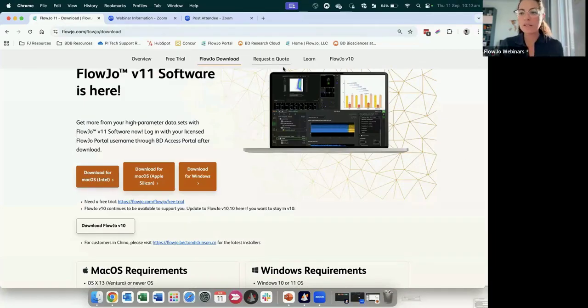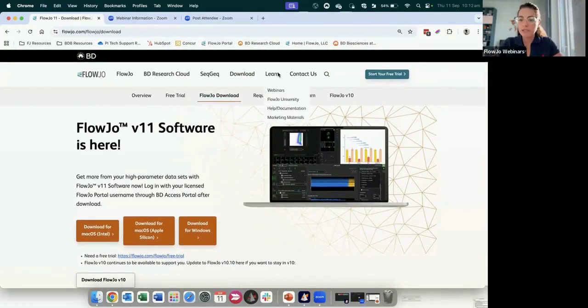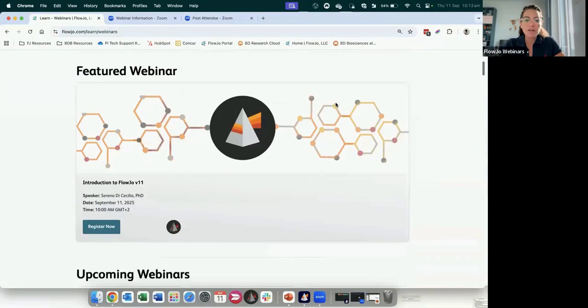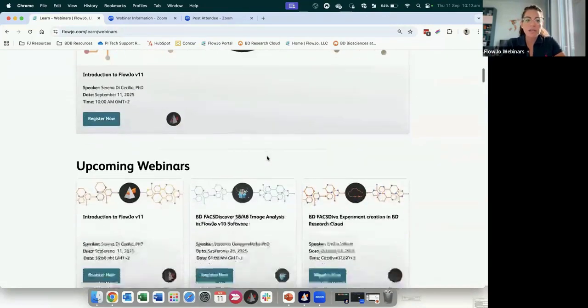Okay, so where do I find the FlowJo documentation, the webinars, and everything? If you go under Learn, right here, you will find 4 different tabs. One is related to webinars. You may have seen that if you are in this webinar today. Here there are all the upcoming webinars.